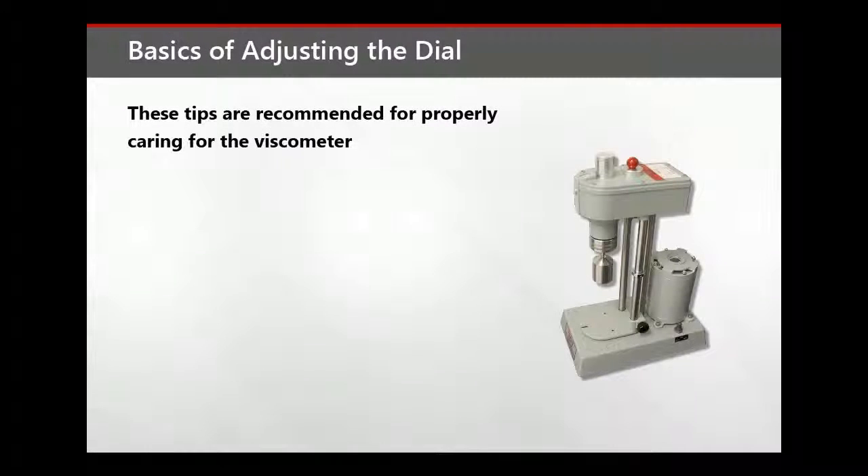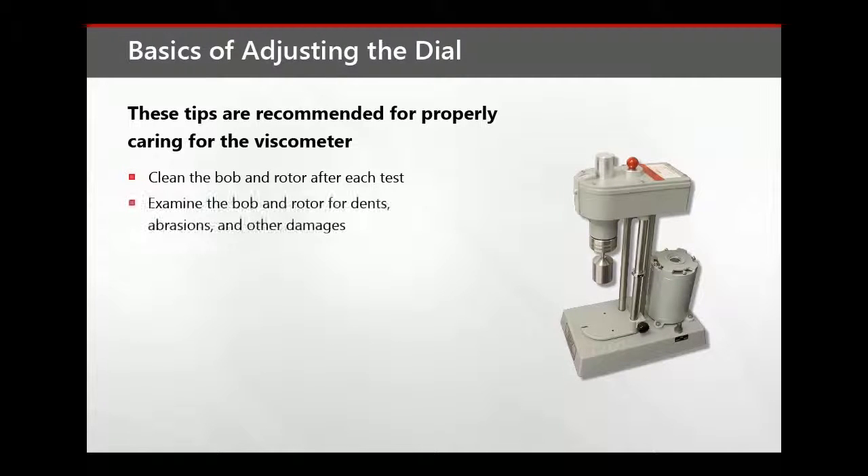These tips are recommended for properly caring for the viscometer. Clean the bob and rotor after each test. Periodically examine the bob and rotor for dents, abrasions, or other damage.